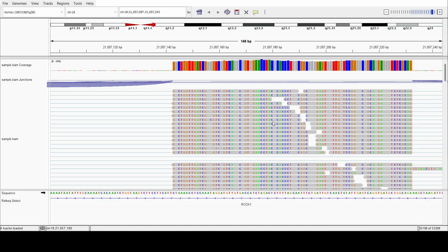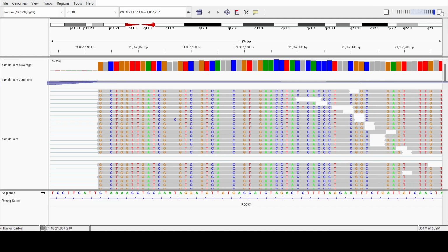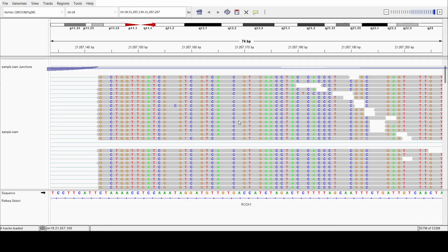These are your sequencing reads. So let's read this graph. The letters at the very bottom are your reference genome. Each gray bar stacked above it is one of your 150 base Illumina reads. The bar graph at the very top is your coverage. It tells you how many reads stacked up on top of each other at the exact spot. If the coverage is 50x, it means the machine sequenced that exact letter 50 different times.